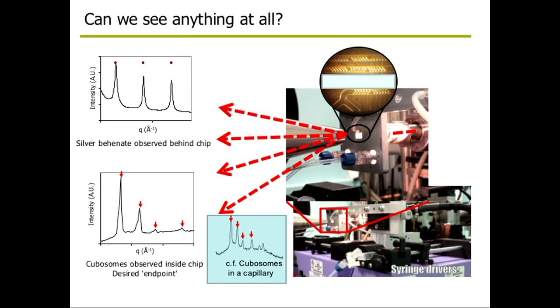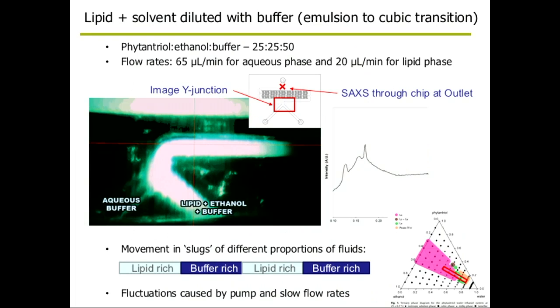So can we see then, by looking at different points along the chip, what happens during the process of mixing? This is where we were all getting very excited about this. This crazy idea is going to work, until we started trying to do some dilution type measurements.